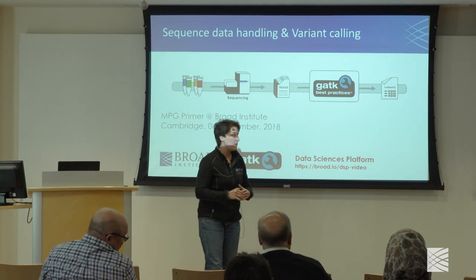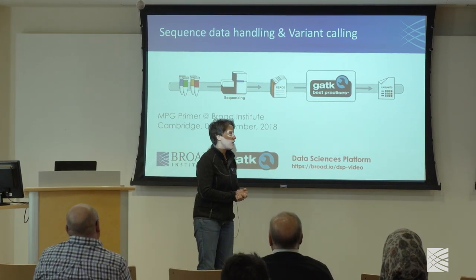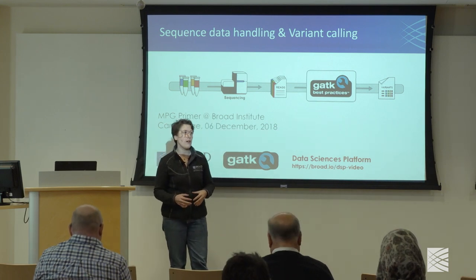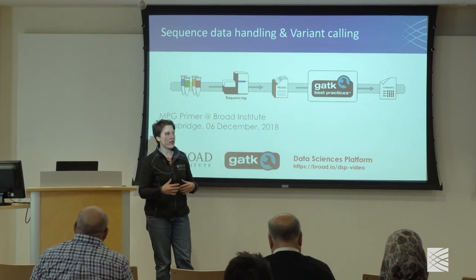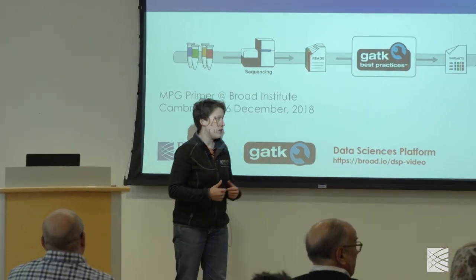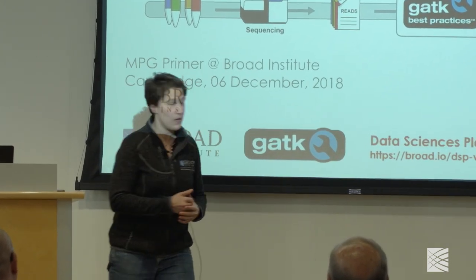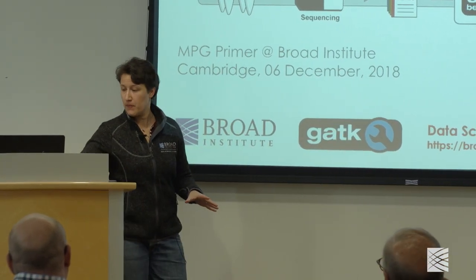This primer is going to be about sequence data handling and variant calling. We're going to talk about how we handle whole genome and exome data for the purpose of variant calling, okay? And I'll talk about several aspects of the data, how we process the data, how we handle the data. I'll also talk about the main variant calling pipelines that we have, okay? Feel free to interrupt me with questions at any point during my presentation.